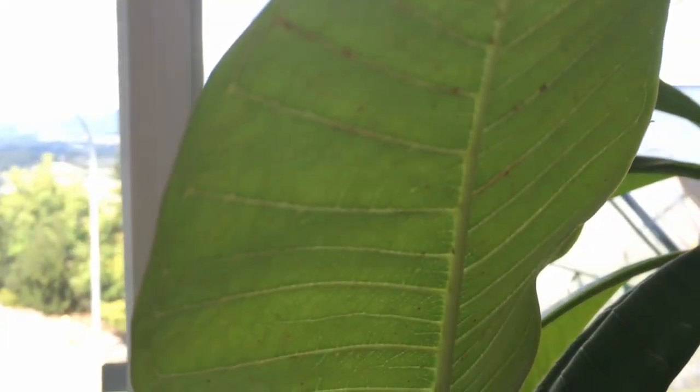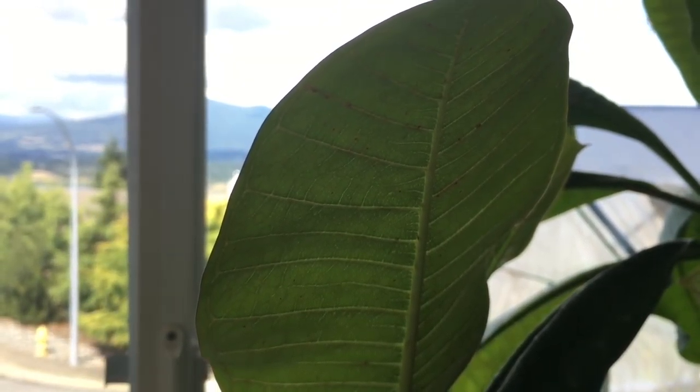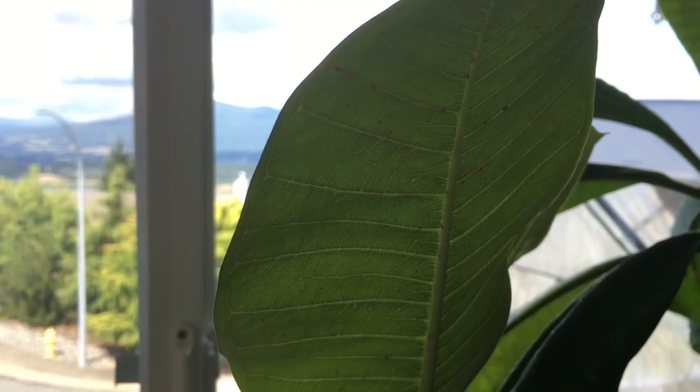There is some stuff that is alive, so I wanted to pull down a leaf and see what it looks like under the microscope. So let's have a look. Remember I have to narrate this — there's no microphone on the microscope. In front of us we have our first look at the scale. There's a dead one above it, and then the live one is below in the middle. You can see eyeballs on the live one. There's also some sort of bug stuck to the goo on the underside of the leaf.